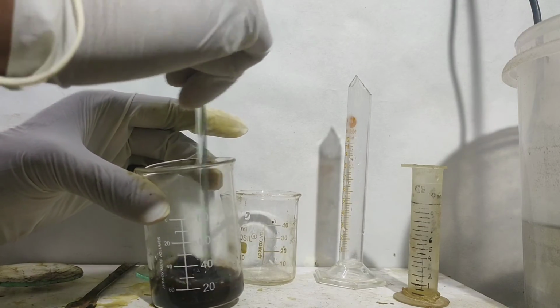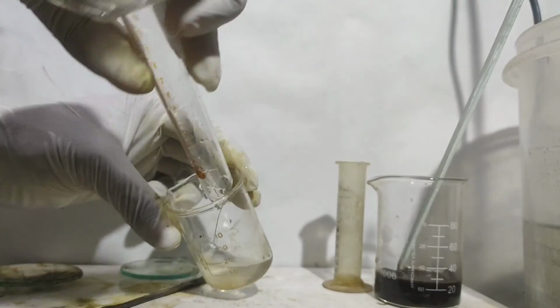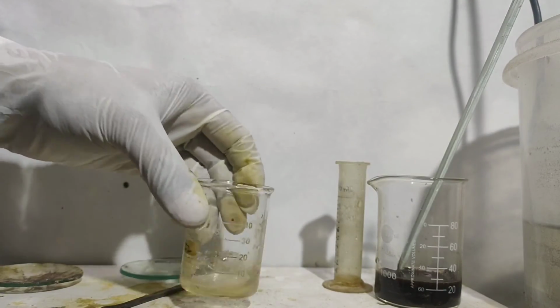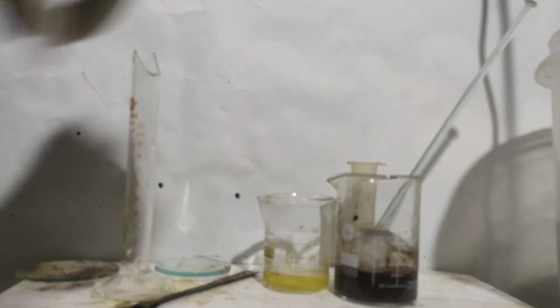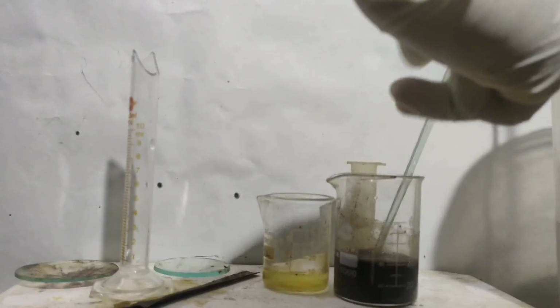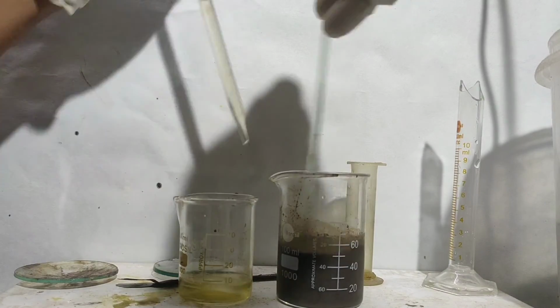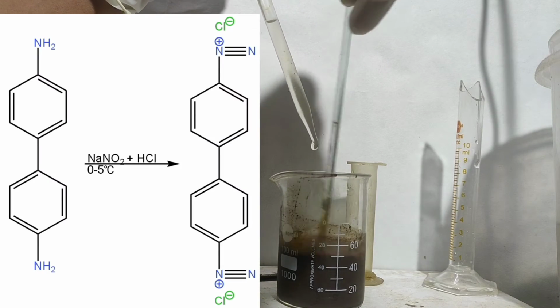I added an additional 2 ml HCl to it and dissolved the sodium nitrite in 7 ml of water. After the benzidine dihydrochloride solution was ready, I added ice to both the solutions and then added the sodium nitrite solution to the benzidine dihydrochloride solution slowly, drop-wise with stirring.